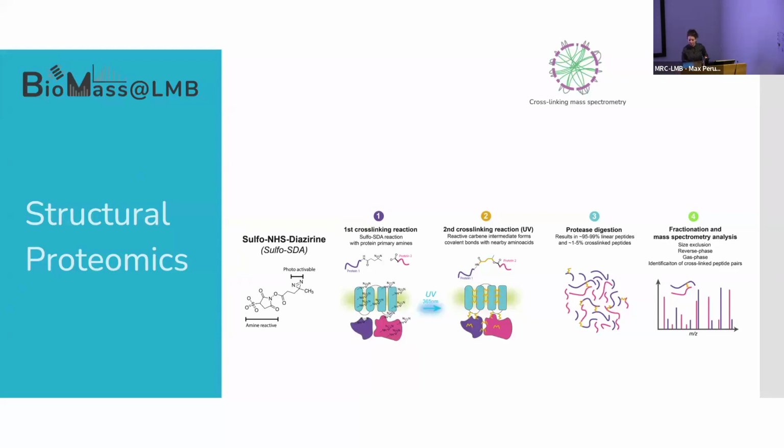And then what we do is we digest. Certain amino acids will be glued, cross-linked to other amino acids, either from the same protein or from the neighboring proteins within your complex. And then we analyze by mass spec.